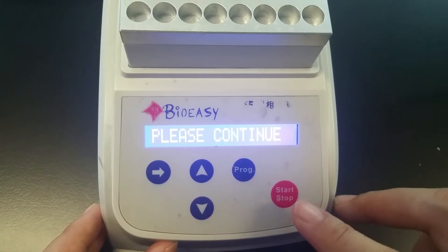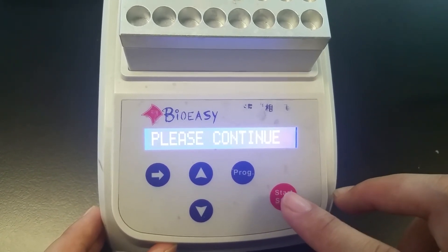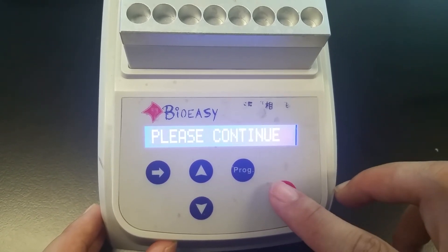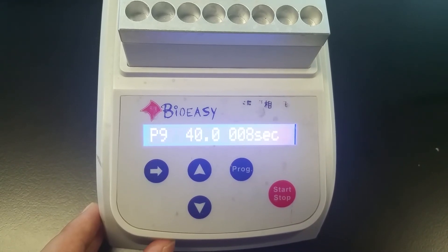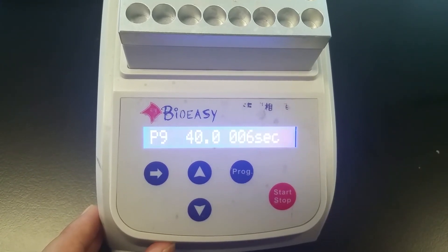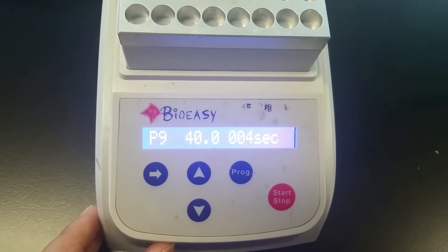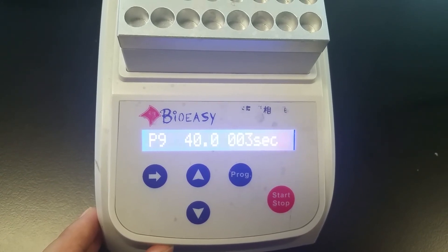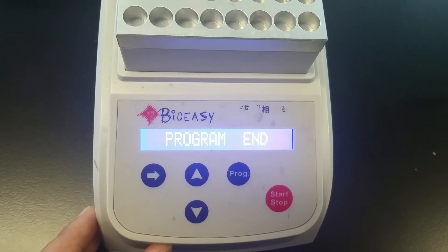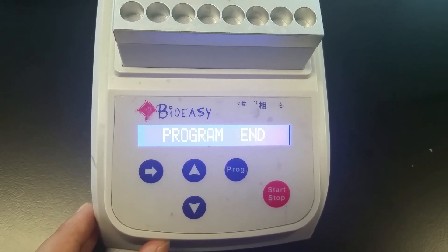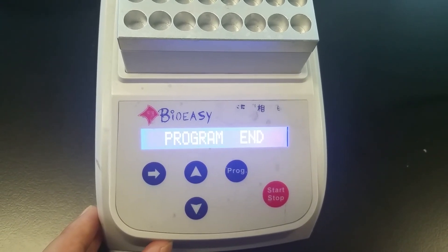Then you can press the start and stop button again to start the second round incubation. And we can see the 10 seconds set for the second round incubation. So the second round incubation is finished.